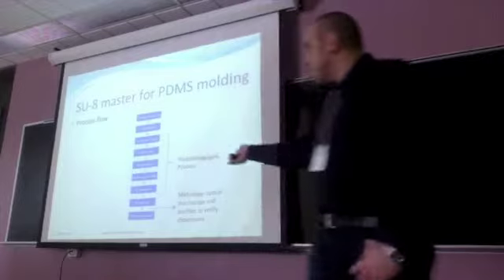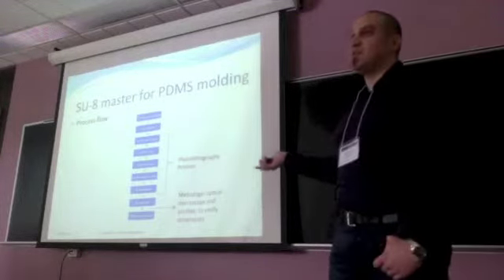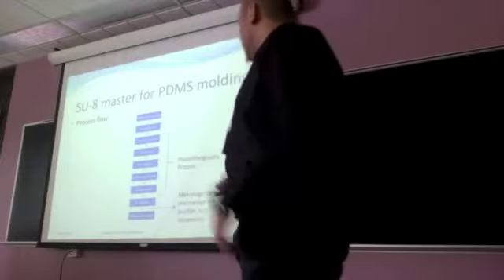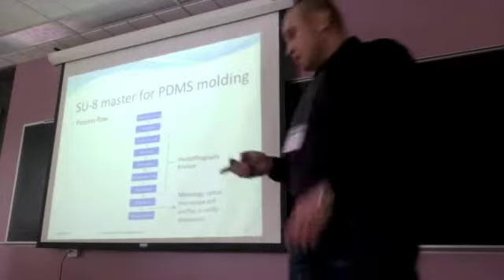And between step 8 and 9, you can use tools to characterize your structure. So you can do metrology. You can use an optical microscope and a profiler to verify the dimensions.